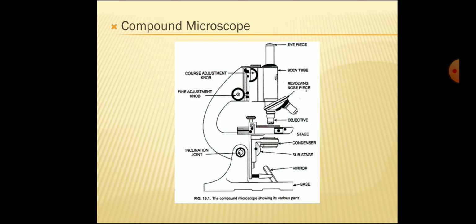The working of the microscope is in such a way that the object is mounted on the stand below the microscope tube. The objective lens forms a real, inverted and magnified image of the object. The image acts as an object for the eyepiece. The position of the eyepiece is so adjusted that the image lies within the focus of the eyepiece. The eyepiece acts like a magnifying glass and forms a virtual, erect, and magnified image of the object.